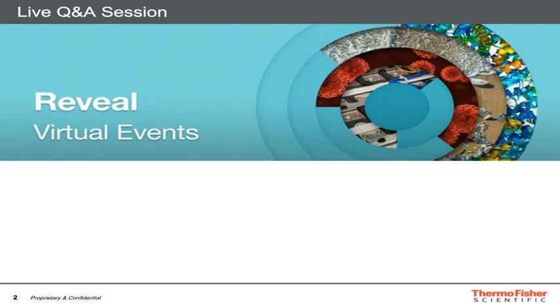Thank you for the question. So it depends on exactly which system you're looking at, but if we're talking about our newest system, the Nexa, then that can take quite large samples. So 60 millimeters by 60 millimeters in the X and Y dimension, and 20 millimeters thick. So 60 millimeters squared and 20 millimeters thick.